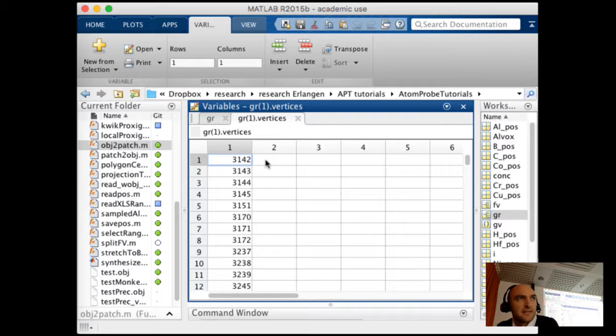For interfacial excess maps, I haven't implemented vertex groups yet because I don't see a reason for it, mainly because it analyzes local variations anyway. So why mark local regions? Maybe there will be a reason at some point, because you want to have different parts analyzed in a different way because of the scaling of the results. It's possible.